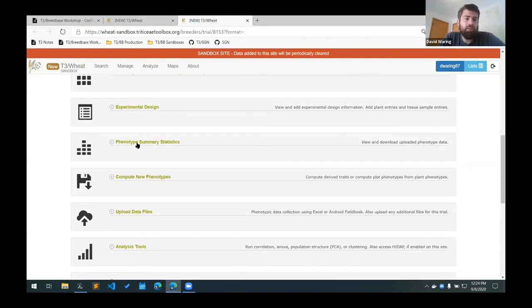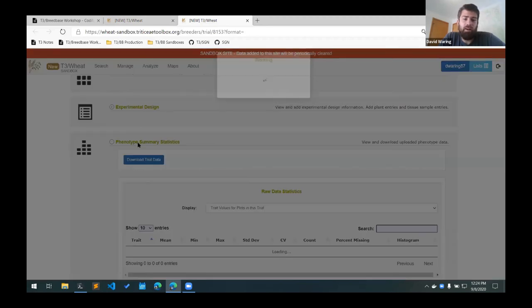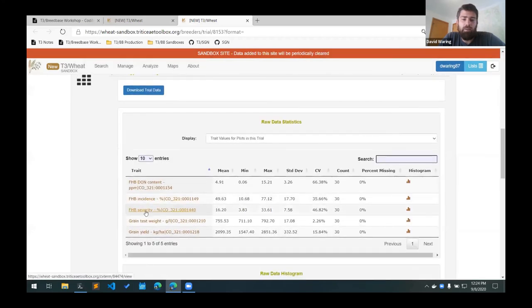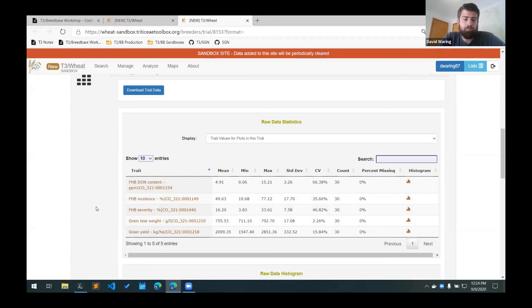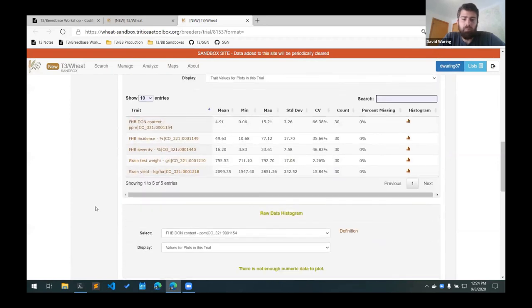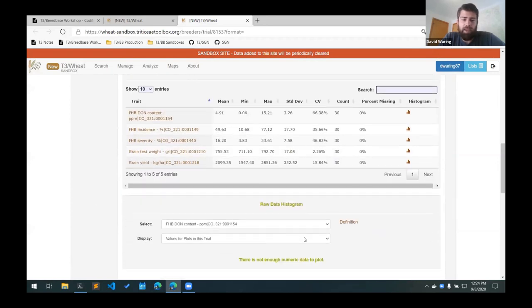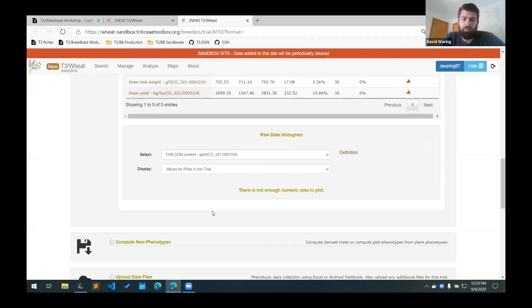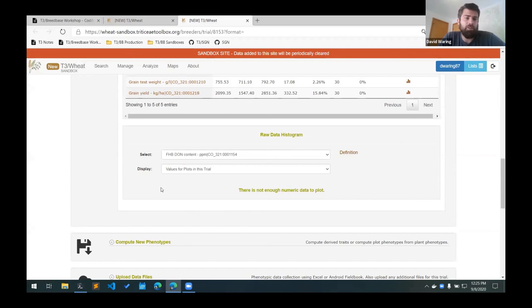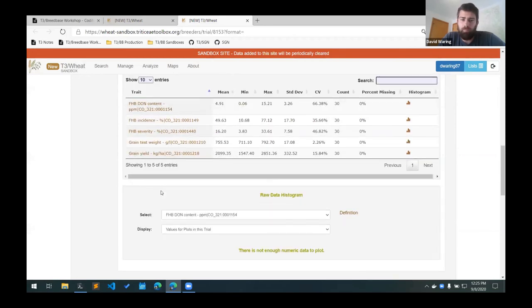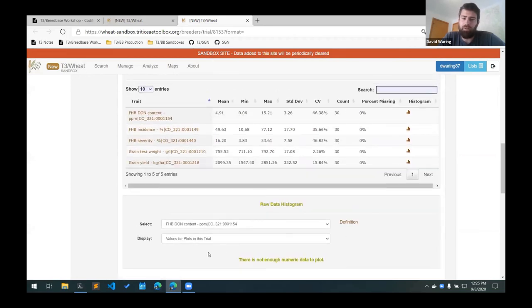What we can see under this phenotype summary statistics here is that we have a table with our summary stats for our observations. And then a histogram of the observations will show up here in a few minutes. It takes a couple minutes for the database to refresh with the new data before that shows up. But there are also histograms of the traits.